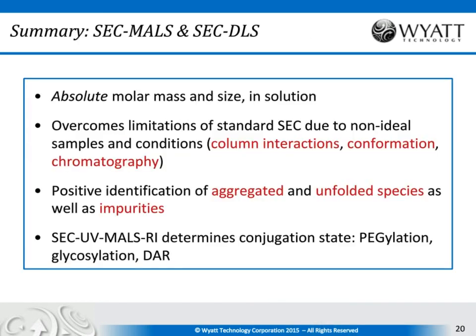So to summarize, SEC-MALS and also the SEC-DLS technique, which is the online DLS, give you absolute molar masses and sizes in solution without reference to molecular standards and elution time. They overcome the limitations of the standard SEC. They will give you positive identification of aggregated and unfolded species as well as impurities, and a particularly powerful analysis that can be carried out with SEC-MALS, the conjugate analysis, gives you the PEGylation state, glycosylation state, or DAR.